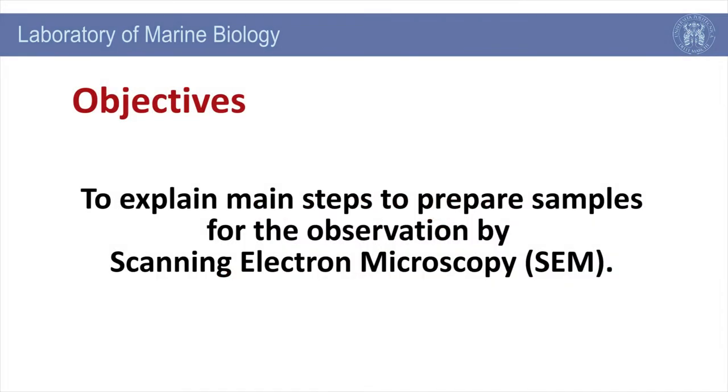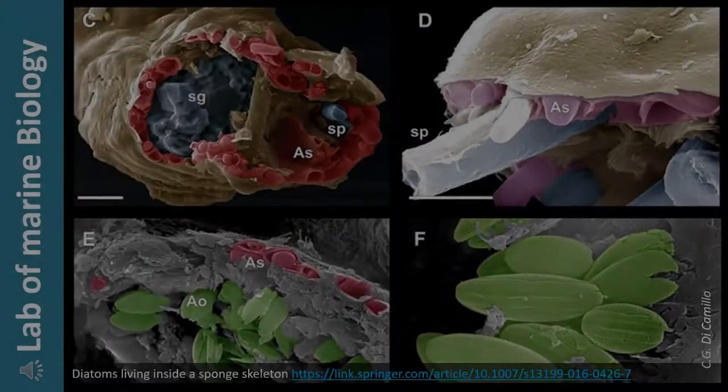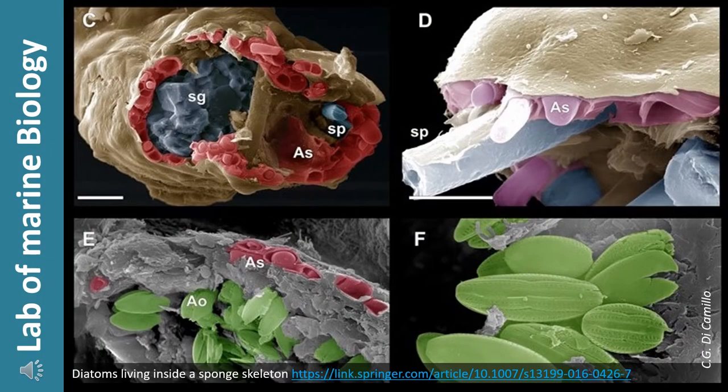The objective of this video tutorial is to explain the main steps to prepare samples for observation by scanning electron microscopy, SEM. Scanning electron microscopy is used to obtain magnified and high-quality images of the ultrastructure of biological samples. This technique allows us to study intimate relationships between organisms.